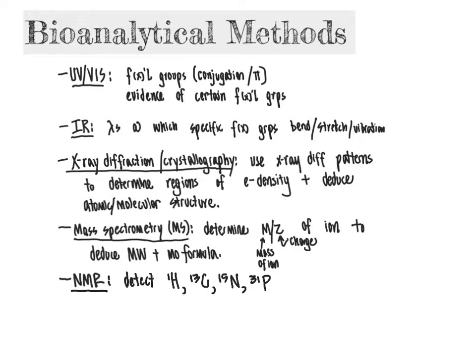These are the ones that are most prevalent when thinking about biological applications of this. So those are the ones that we're going to focus on here. But we're able to detect those atoms and use the resulting spectra to determine the connections between atoms.